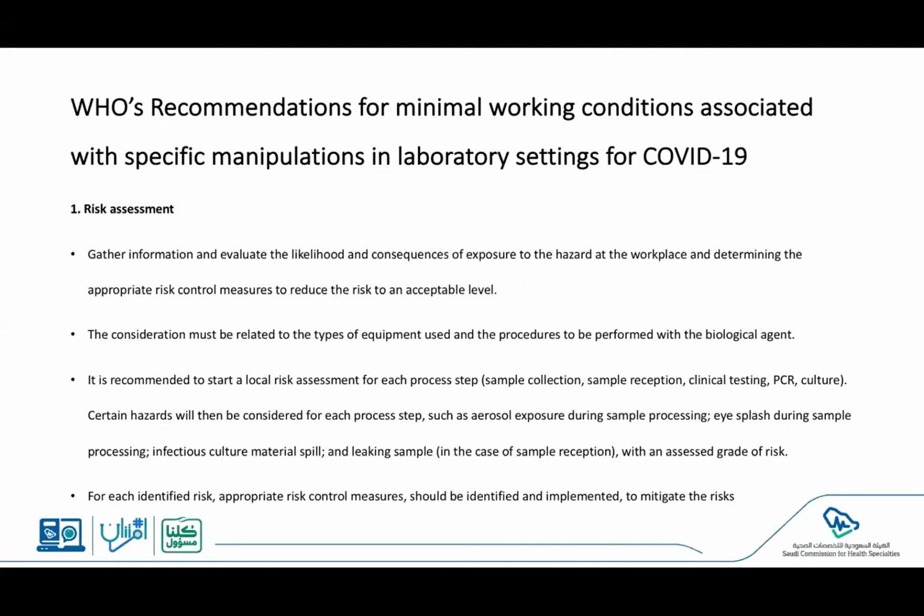But there are certain specific recommendations that the World Health Organization has put together for the minimal working condition associated with this specific manipulation with COVID-19, with the virus that is causing COVID-19. And first of all is the risk assessment. We really need to gather the information to evaluate the likelihood of consequences for potential exposure to the hazard at the workplace. And that is by going through the related type of equipment that we are going to use and the procedures that we are going to undertake associated with the biological agent that we're working with.